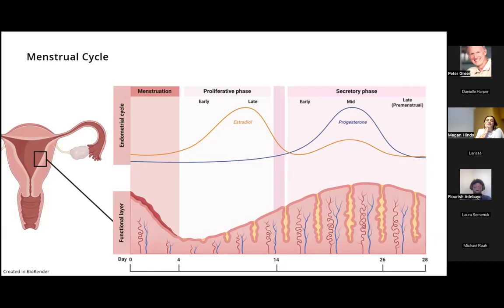Yeah, so it's been tricky just with timing, right? For me, the methods have to work like this: if I get a menstrual blood sample one morning and I don't know it's coming, it's hard for me to schedule an appointment to go do FACS sorting. A lot of times I get a text from someone saying, I have a tube for you. And it's like, go time, right?